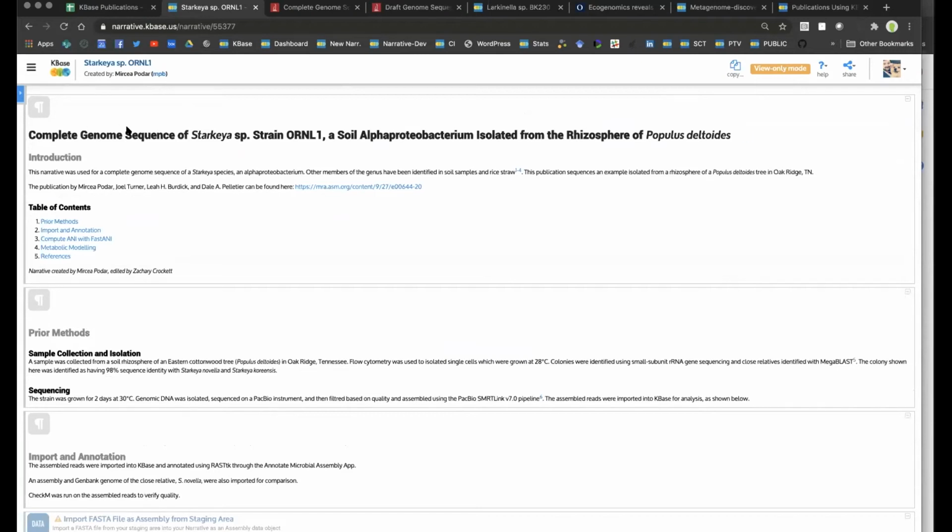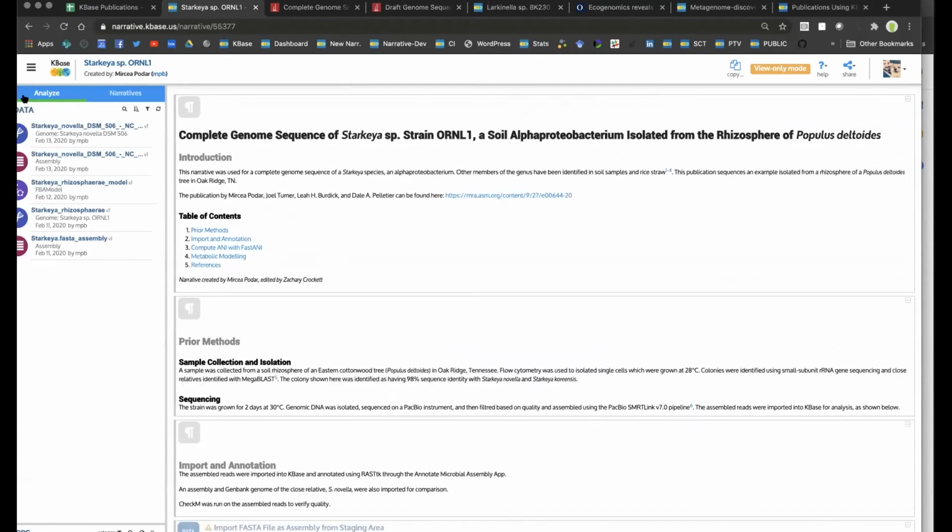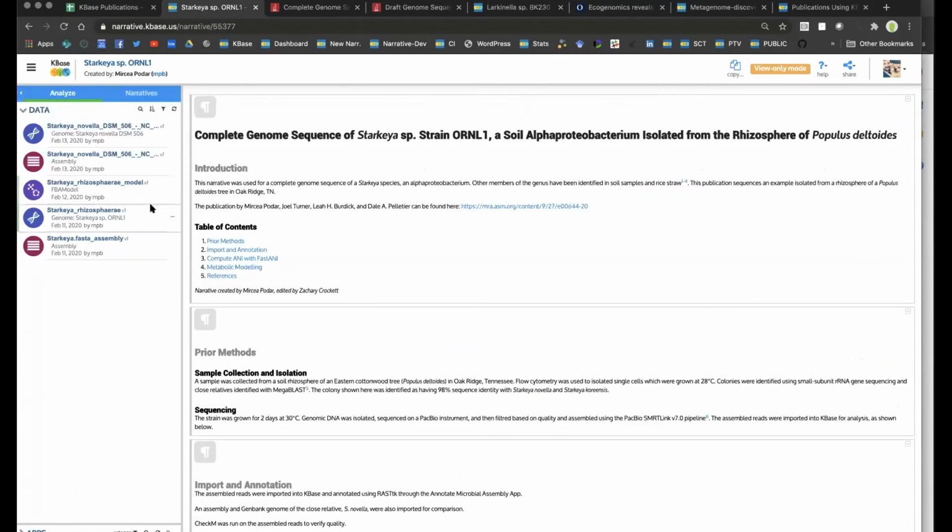And so, okay, let's say I am someone from the outside coming in and I'm like, well, I can see the narrative, but maybe I want to check it or validate it. How do I get access to it? So I can click this button to re-drag out here, and you can see that I can't add any apps or anything, but I can access their data.